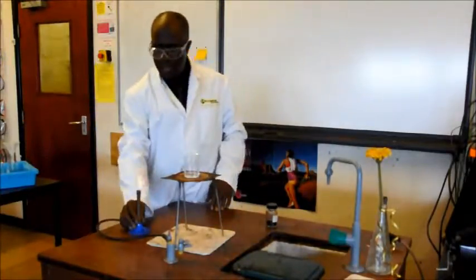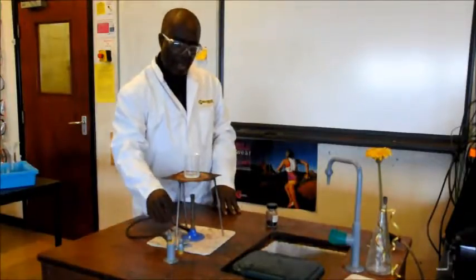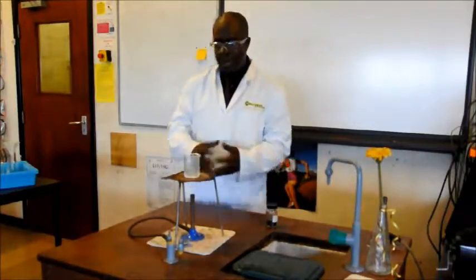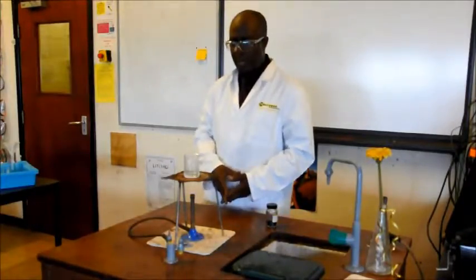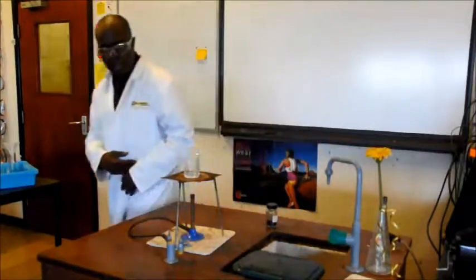Then it's a simple matter of warming the acid. We must warm it, but we mustn't get it to boil. Now, it's possible we could use a water bath and leave it in there until it warms up, but with a bit of care, we just heat it for a while, and just before it starts to boil, we'll take the heat away. So this session will just be heating the acid.